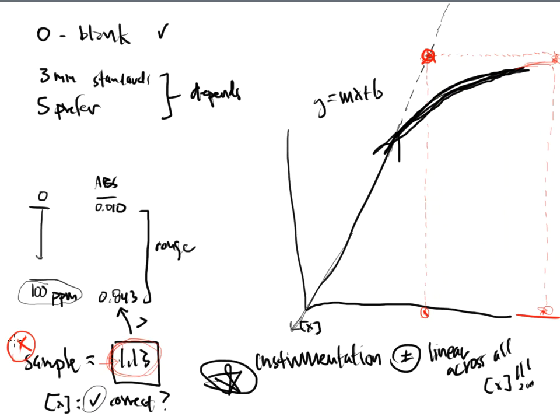For you mathematicians, you're going to argue and say, well, theoretically we can. Yes, we can. But theory's different than practicality, because our instruments are not linear for infinity. Our instruments begin to deviate from the linearity and they begin to curve. Every one of them begins to give me a curvature in the calibration curve, and I have to take that into consideration.